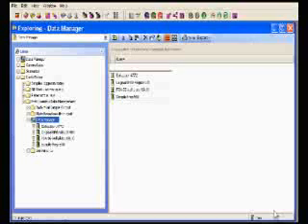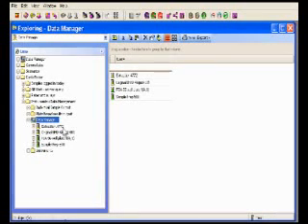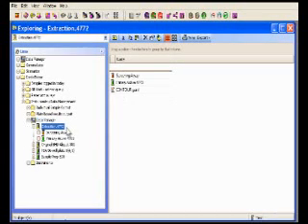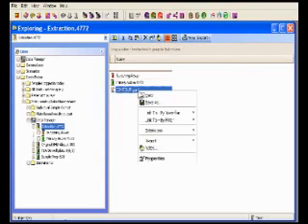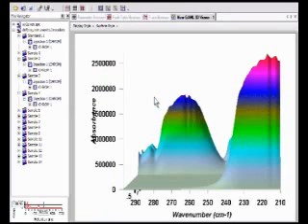Traditional LIMS only capture final sample results and require scientists to access the original instrument software to view raw data, which may be in a separate machine or a different department. Nautilus goes beyond simple result capture and allows users to view and manipulate raw data directly from the LIMS. Instantly drill down from LIMS results to the original data.